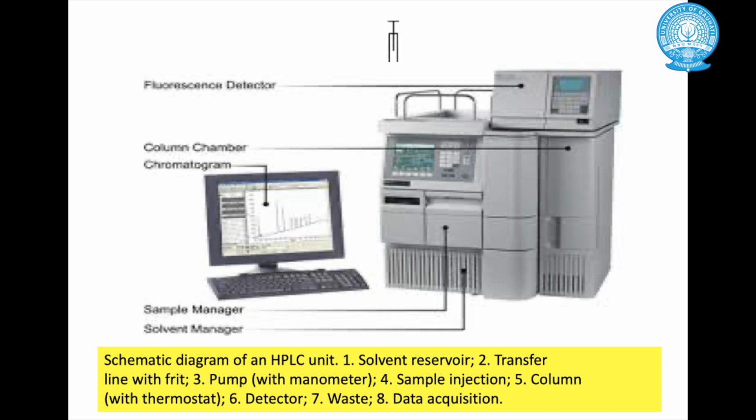That means there will be no interaction with the packing material or the octadecyl silane, which is the derivatized form of silica, and because of that the polar compounds will elute faster, it will be detected faster, whereas the non-polar compounds, because of that hydrophobic interaction, they will be retained longer, and it will elute after all the polar compounds have got eluted.